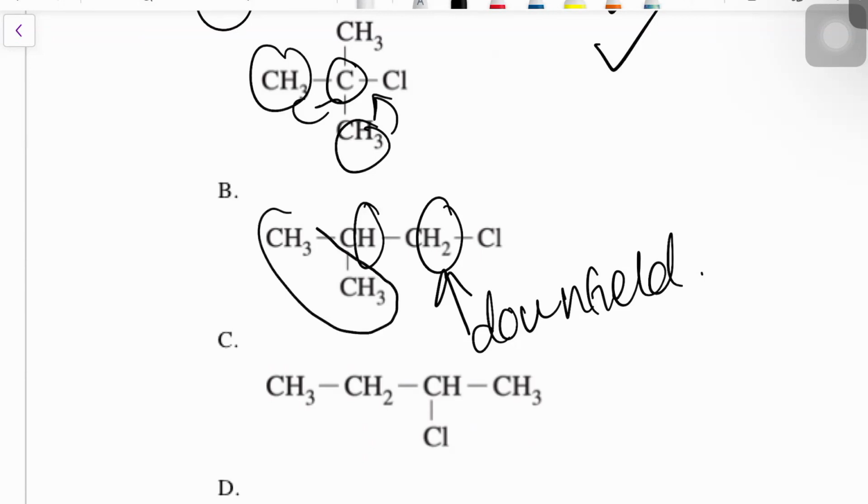These hydrogens, however, are both attached to the same carbon. So they're not in the same line anymore. They're attached to the same carbon, and this carbon, once again, can rotate. So this is going to be 1 peak, 2 peaks, and 3 peaks. And that third peak is going to be integrated a little bit higher. And then this one does have neighbors.